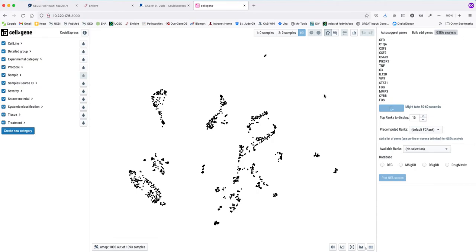And maybe I can already tell you that the results we are going to see are not going to be exactly the same as those that we described in the paper, because the GSEA is using bootstrapping, and because of that, the normalized enrichment scores that we report are going to be slightly different every single run when we repeat the analysis, even with the same input genes.